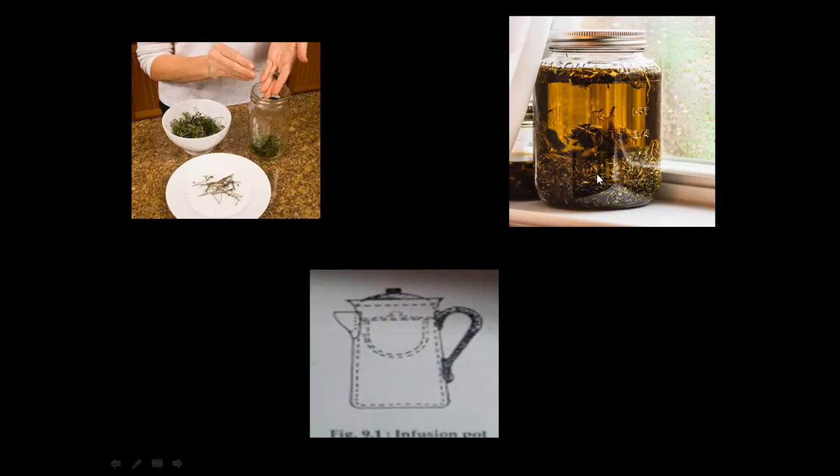When the menstruum enters the raw material, the drug within becomes a solution, and because of the difference between the menstruum and the solution, exoosmosis takes place, and then the fresh menstruum goes inside, and the solution forms again. But in this pot, the solution is always present only at the bottom of the container, and it never comes up. So when you use a normal pot, you require continuous stirring.